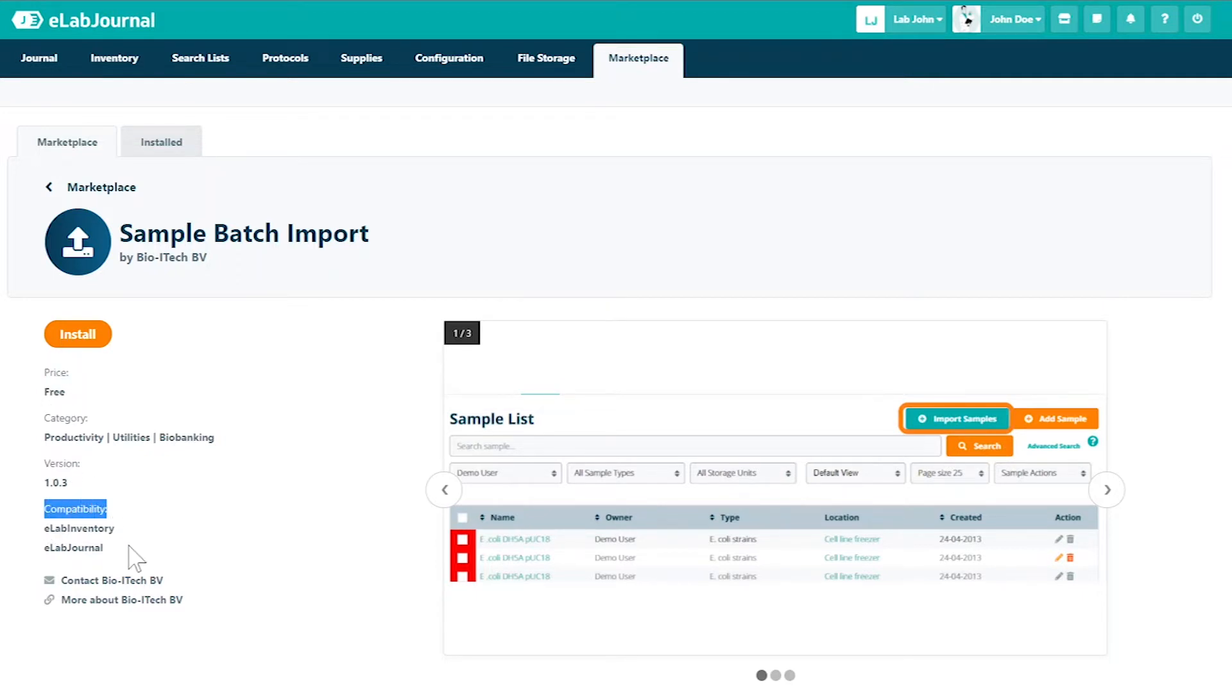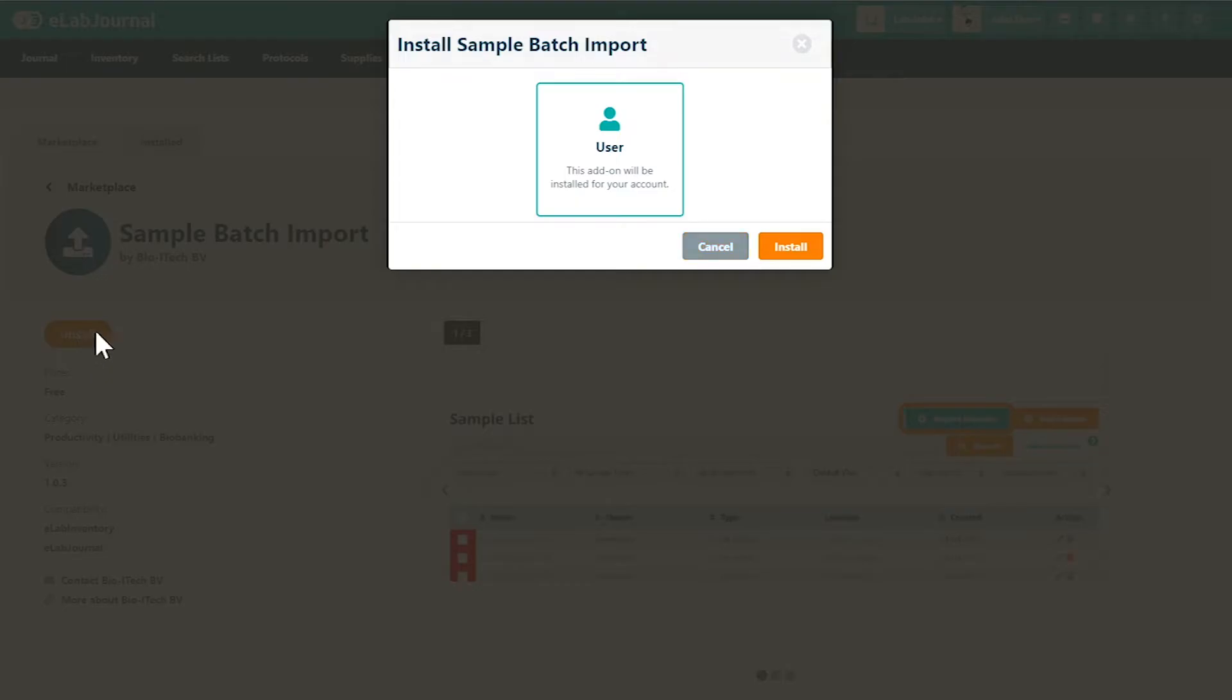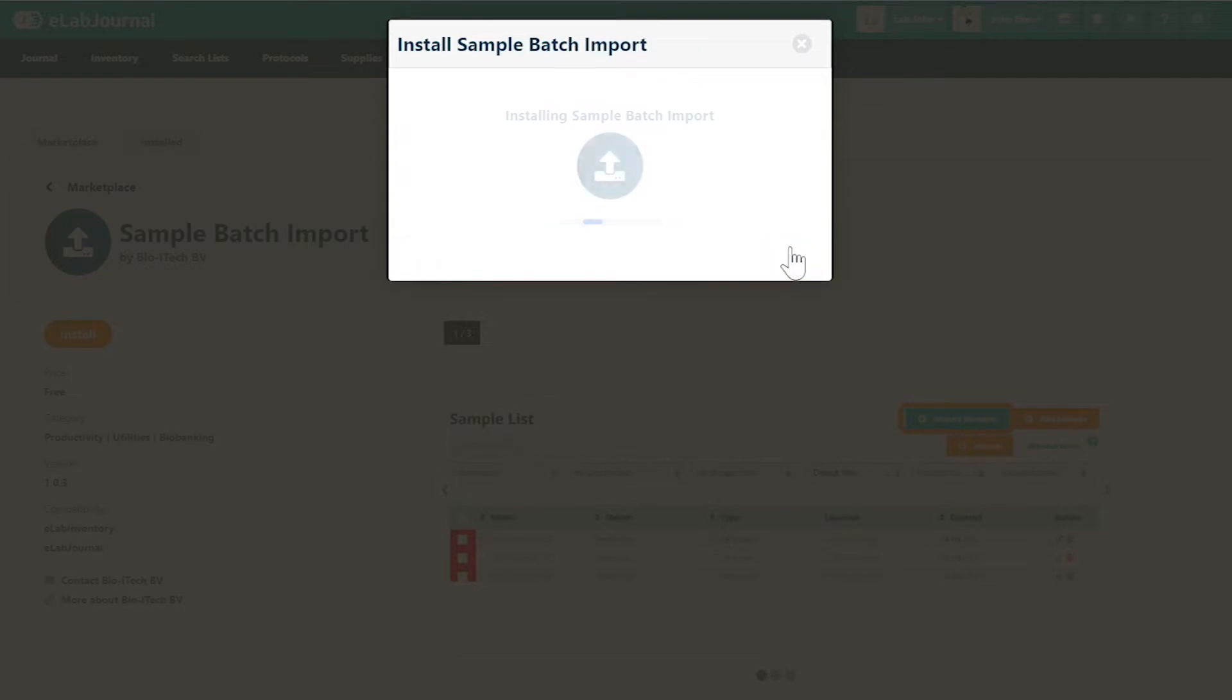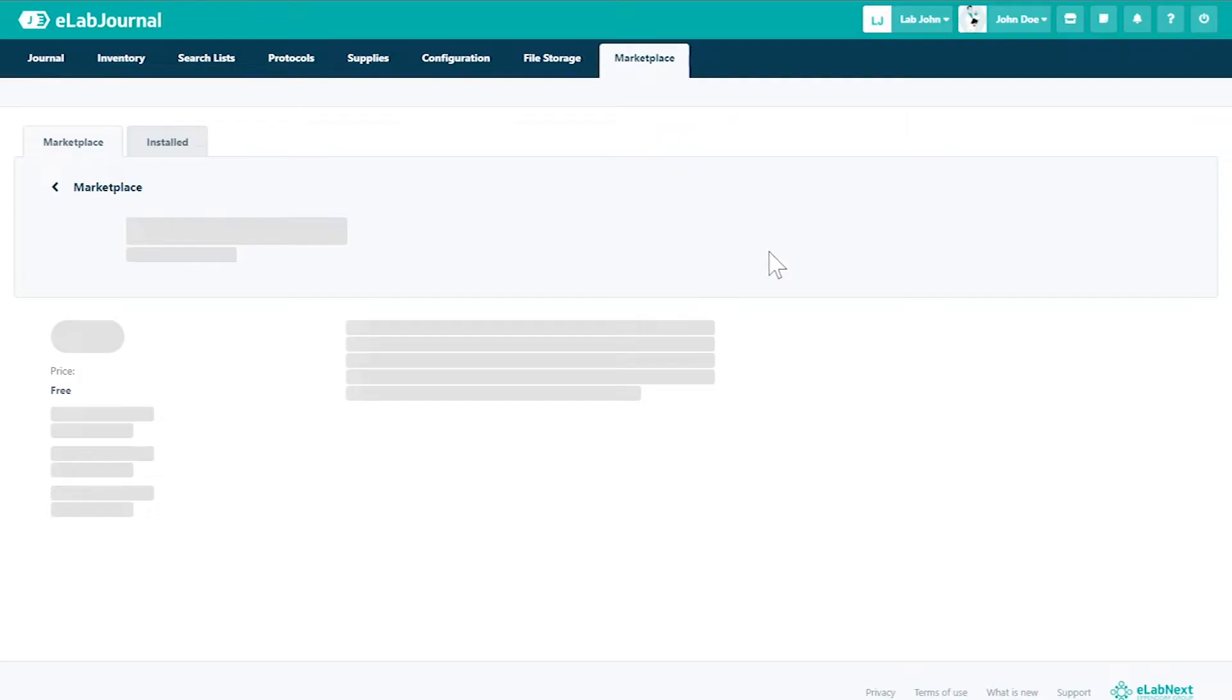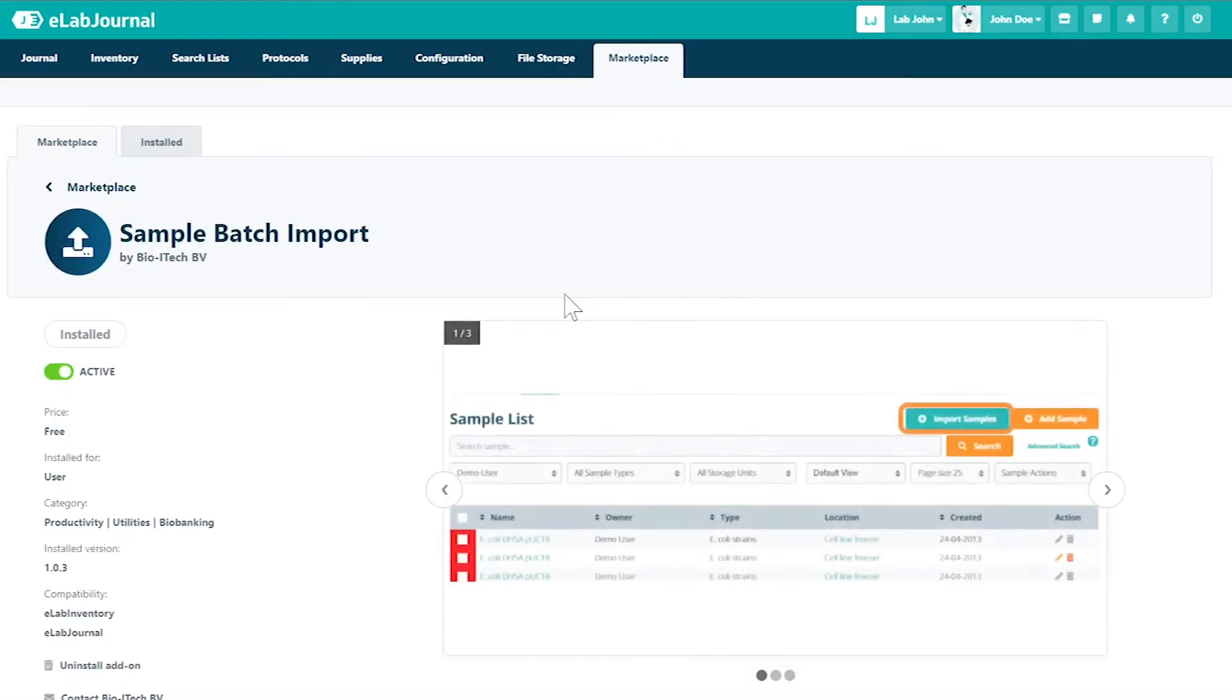Next, click install and complete the process. Once the add-on has been installed, it is automatically activated and ready to use.